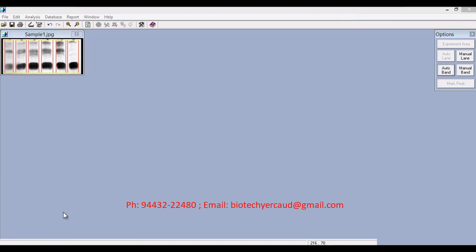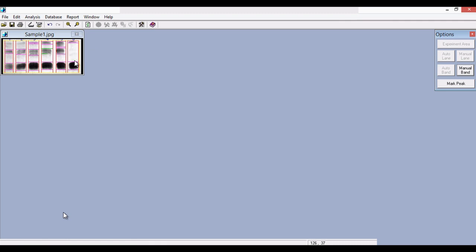Similarly, you can use the auto band button to draw the bands automatically. You can see that the bands for every lane are drawn automatically. Sometimes bands can also be closely placed, so in that case we may have to manually delete the merged band and draw it manually. Let's delete a particular band and go to manual band. Click on the manual band button and draw a vertical line corresponding to a particular band. You can see that these two bands are manually selected and created. This is how we manually select a band. We have now seen automatic lane selection, manual lane selection, automatic band selection, and manual band selection.